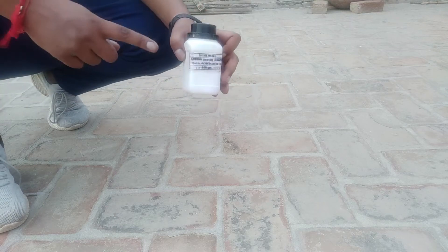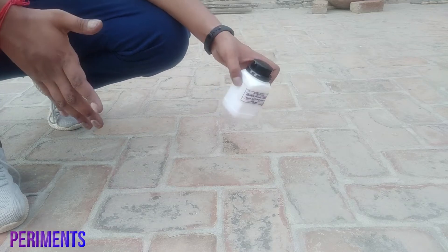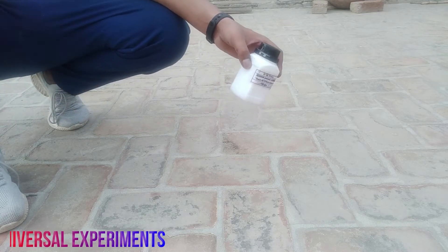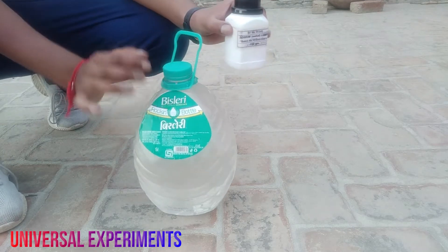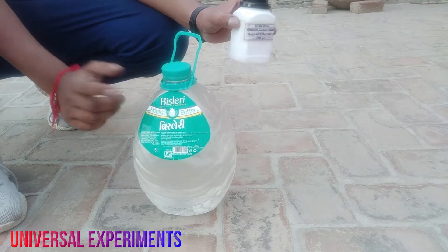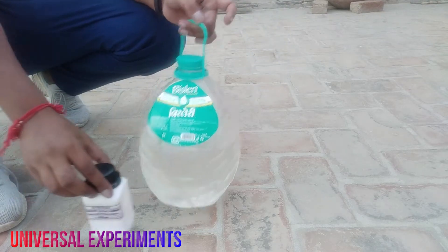Hello friends, today we are going to add sodium metal in a 5-liter bottle, so what will happen? I think I don't know, but we have added a 5-liter bottle. What do we want to add sodium metal after reading it? And then we will see what will happen. Let's go!